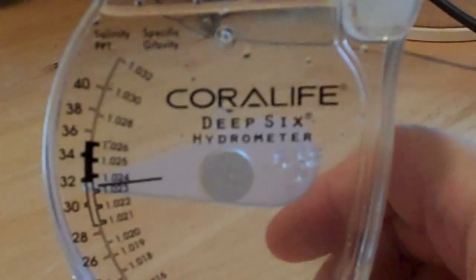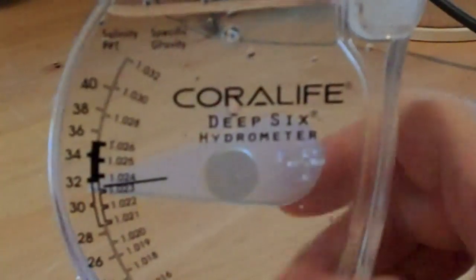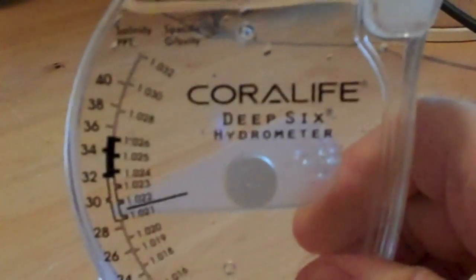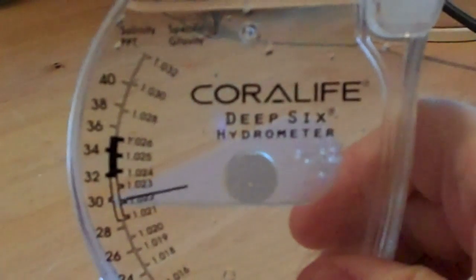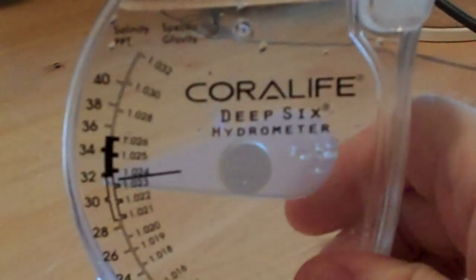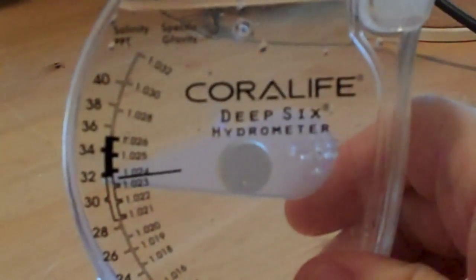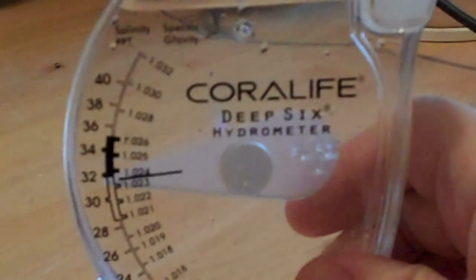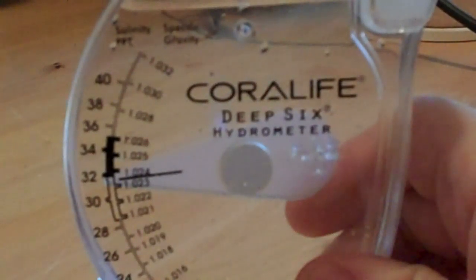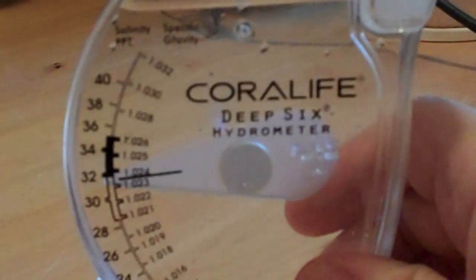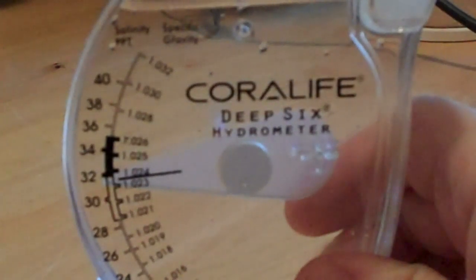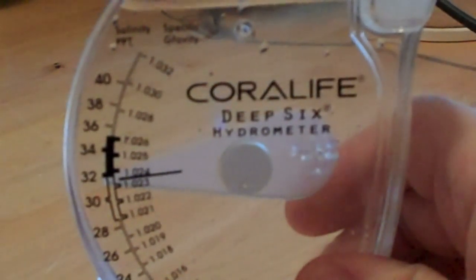We have our water here in the hydrometer. Got the bubbles out. I have to hold it a little more level because my table here is not perfectly level. It looks like it's between 1.023 and 1.024. That's what this hydrometer is reading.